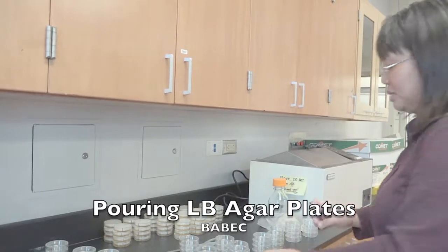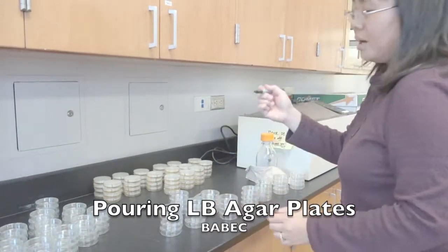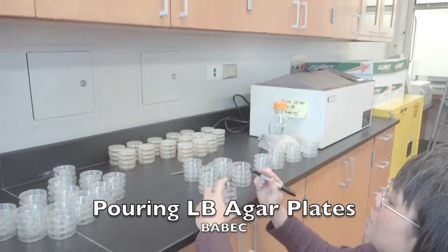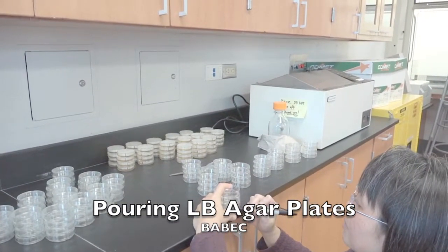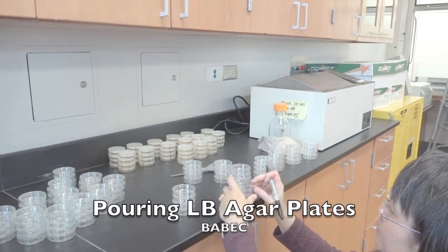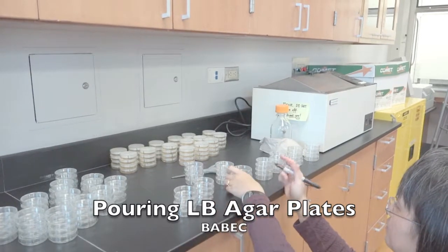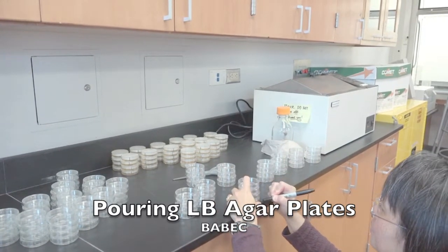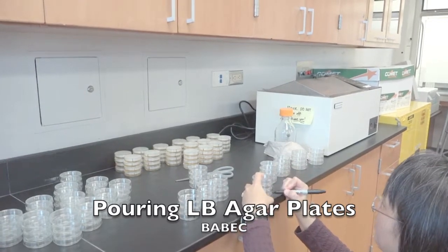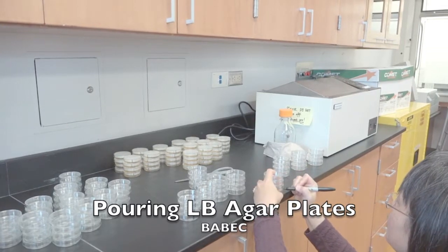What we do in Baybec is that LB agar plates have a black mark. So I have a black Sharpie here, and what I do is just take it to the edge and mark off the lid so that I have one black line. This is our marking system.